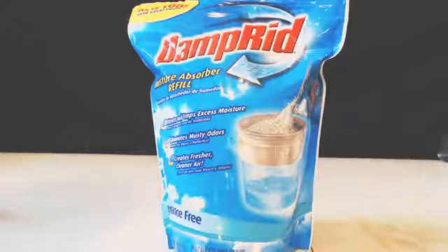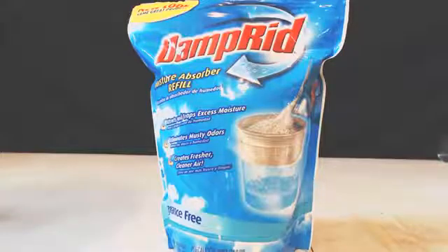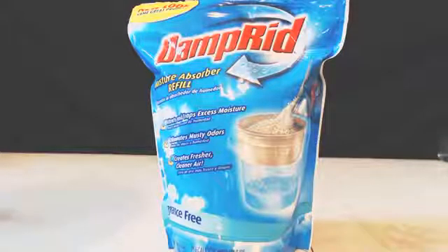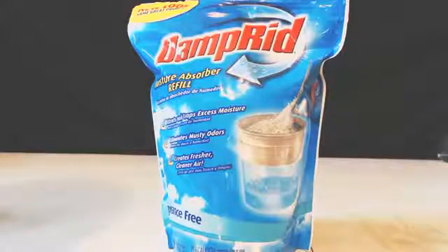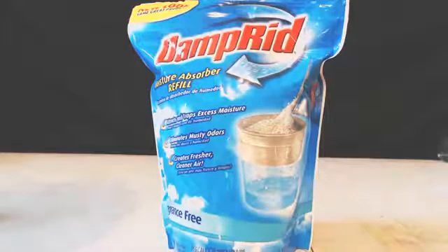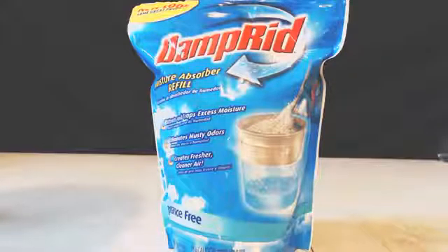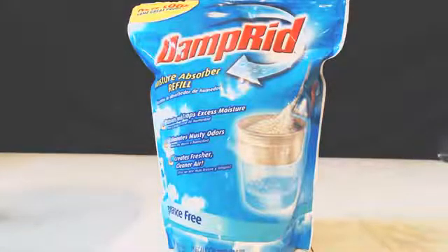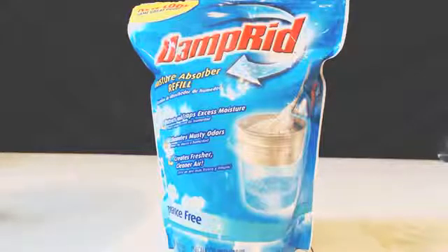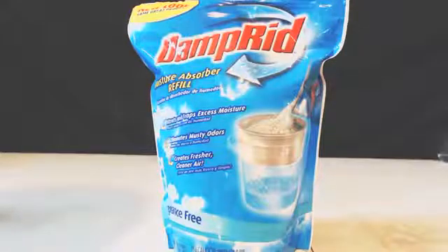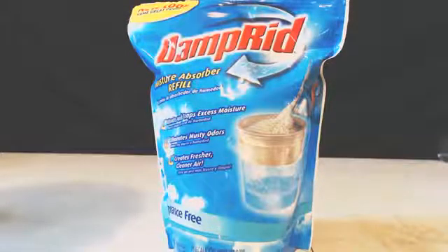The reason I found out about this is I was using this to dry something that had some alcohol in it. When I threw it in, instead of it getting like crystals—usually the powder will turn into like a crystalline substance when it incorporates the water molecule or whatever molecule into the crystal lattice—but when I threw this in, it reacted with the water and it complexed again, but it looked more like phlegm, like someone spit a hawker into my stuff that I was trying to dry.